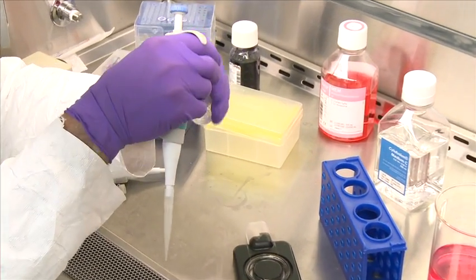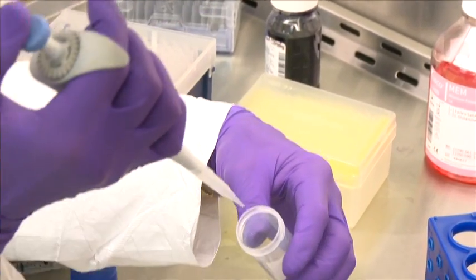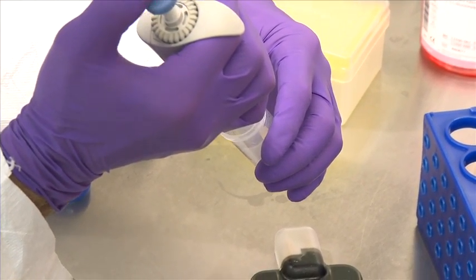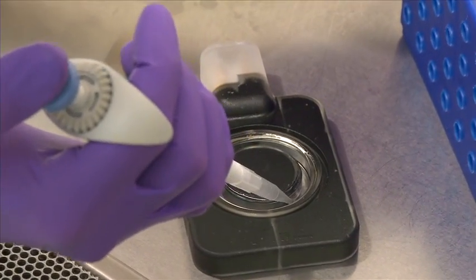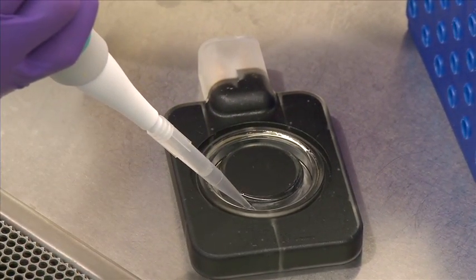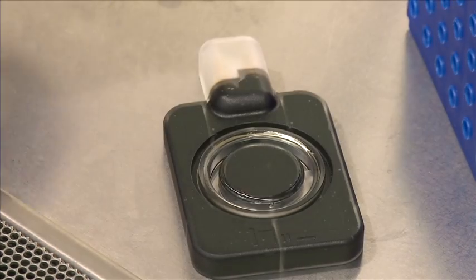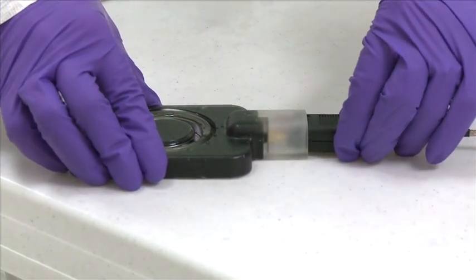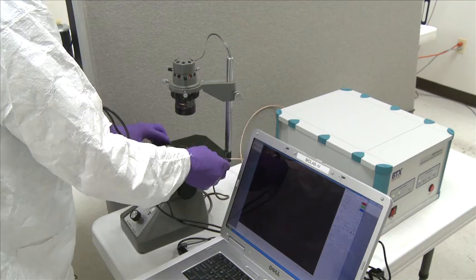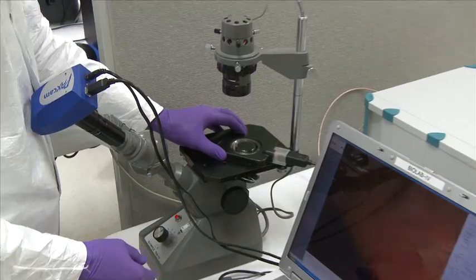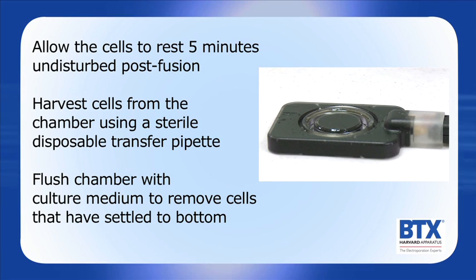Carefully pipette the resuspended cells into the chamber. Add 2 mL of cells to the 2 mL chamber, or up to 9 mL of cells to the 9 mL chamber. The fusion should be performed within 30 seconds after adding cells to the chamber because of settling. Connect the chamber to the HYBRAMUN chamber connection cable and move the chamber to a microscope. If using the 2 mL chamber for optimization, run the HYBRAMUN protocol. View the cell alignment to verify fusion. Allow the cells to rest 5 minutes undisturbed post-fusion.